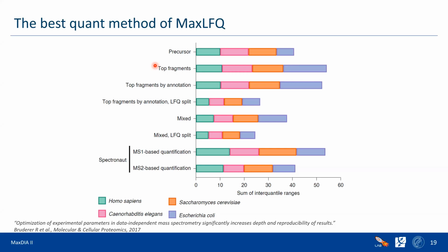We have sample 2 and another set of top fragments, and they can be really different sequences. We can have different masses, and what we're doing is not taking them all separately, but summing them up. Let's say we're taking the top 6 fragments in sample 1 and sample 2 and summing them up, and these summed values we are using for normalization.